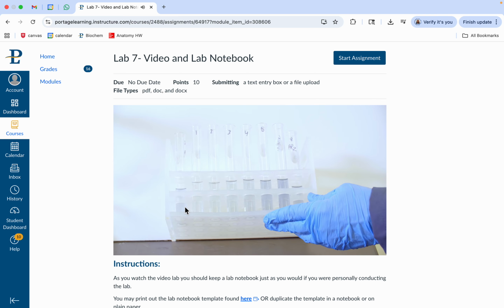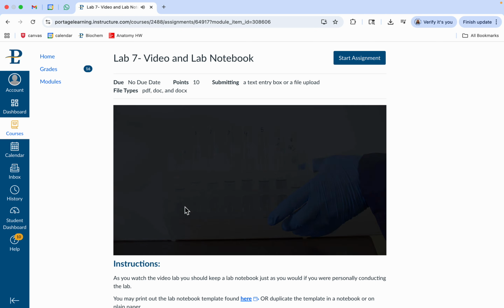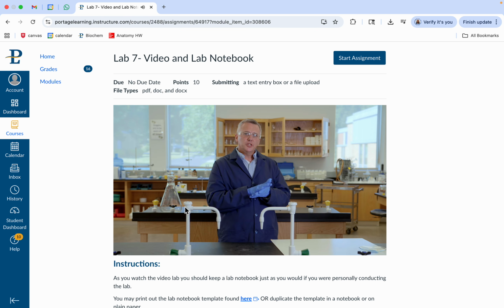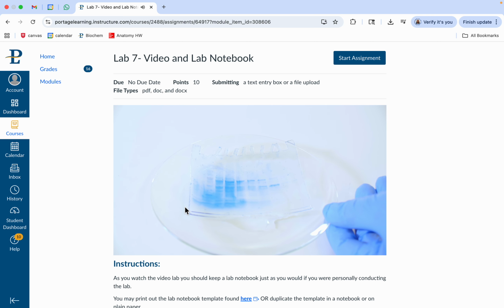In addition to this, we're going to take our proteins from 26 and 27, and we're going to run an SDS-PAGE gel to confirm the presence of GOT. All right, so we're back for our final analysis. So we've looked at GOT activity along the way. One of the final things that you typically always do in a protein isolation is run an SDS-PAGE gel. All right, so we know we have a specific activity for GOT, and we ran the GOT specific activity. But a protein gel is always helpful to make sure you have the correct molecular weight. Another physical aspect of this.